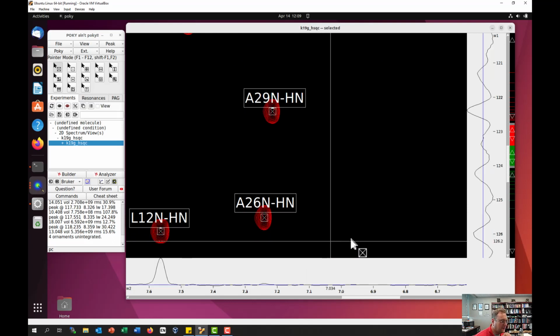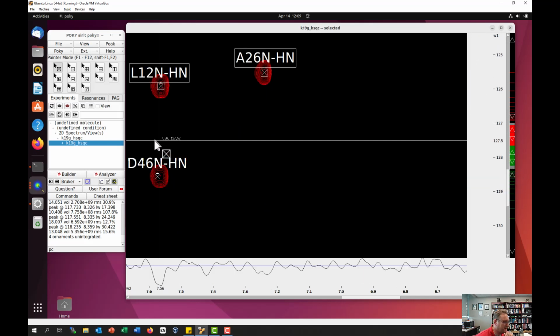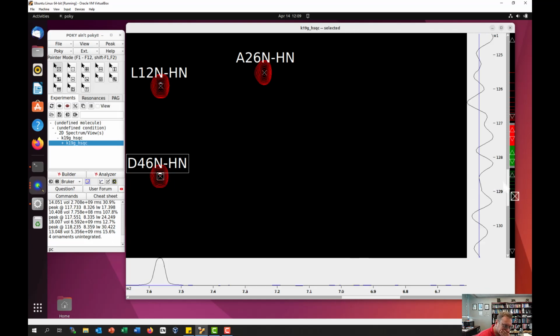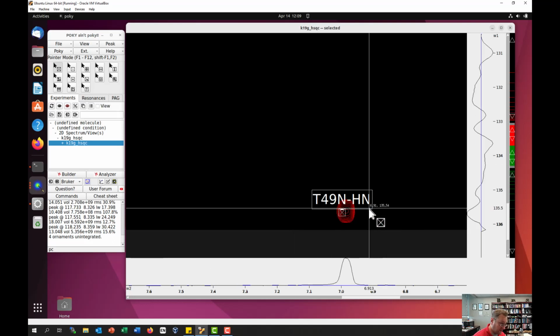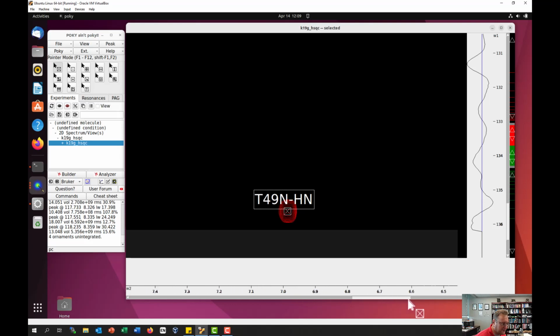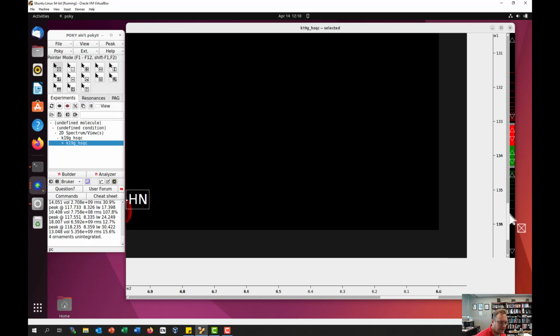So again, lowercase c, lowercase p, lowercase c. And so now we'll just, probably we don't have that much, so we'll just move all the way to the right. Yeah, so the spectrum ends at 6.